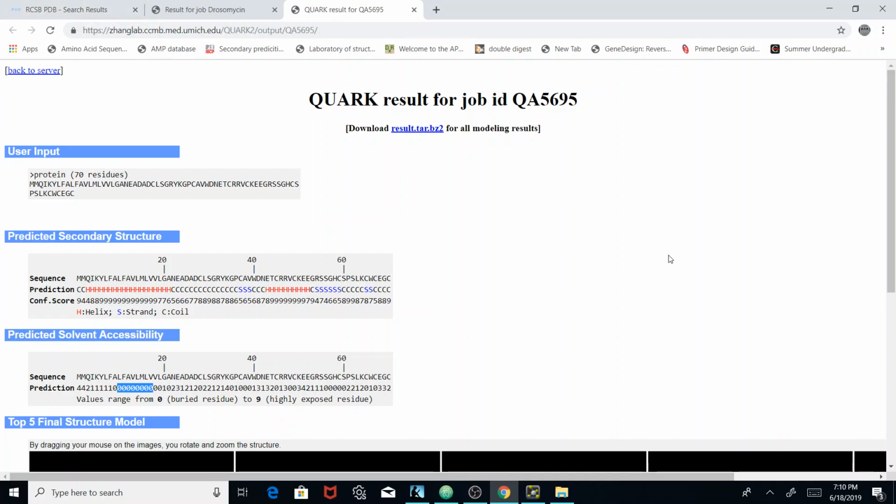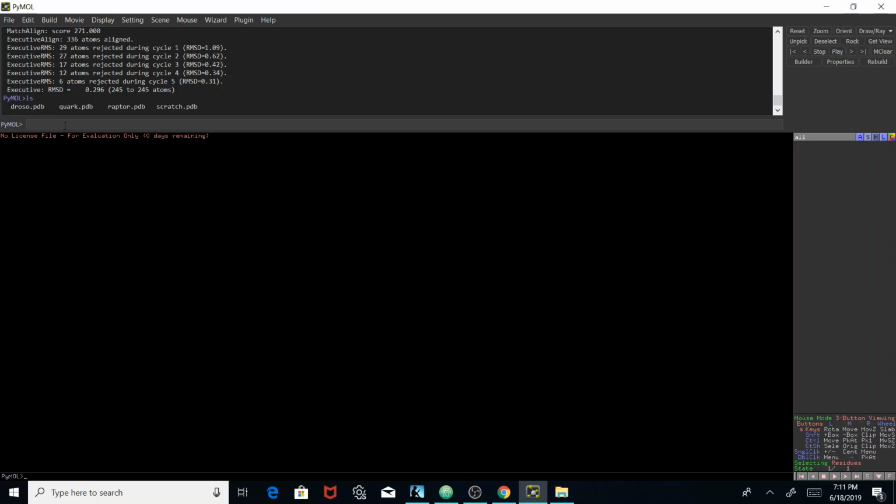And we're going to be using Pymol. You can use Chimera too, and we're going to be visualizing the protein structures and looking at the different structures that are resulting from the different methods that we use, like homology modeling, protein threading, and so forth, and de novo. So we're going to go ahead and look at the structures. So we can open up Pymol or Chimera. I already have a tutorial with Chimera, so you can use Chimera if you have any trouble with Pymol. I just prefer Pymol because I've been using it more.